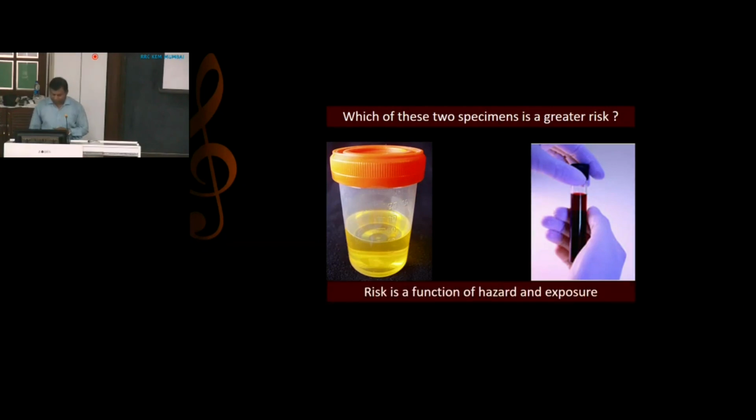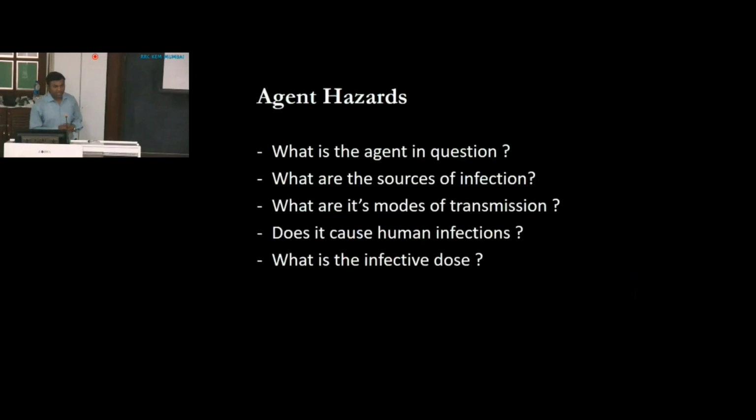So hazard and exposure. What can be the hazard? Either the agent hazard or the procedure hazard. Some procedures like centrifugation create a lot of aerosols. Understood? So the risk will be much higher after you have done centrifugation. In some procedures there might be no need to open the container, just seeing whether the quantity is sufficient or not. So no risk.